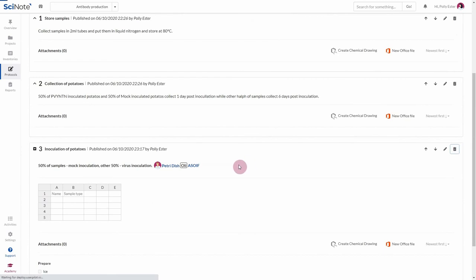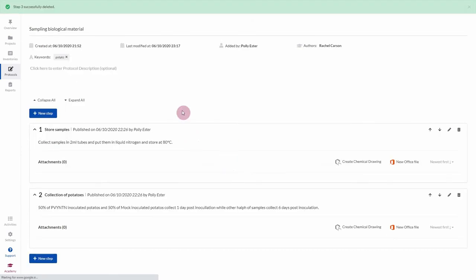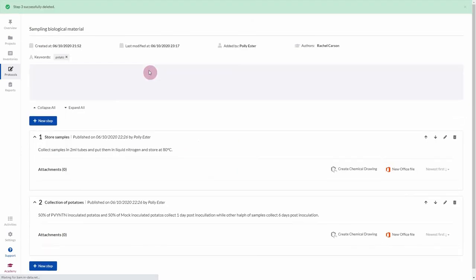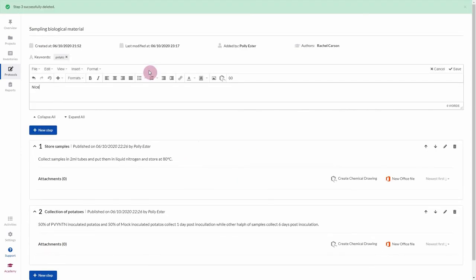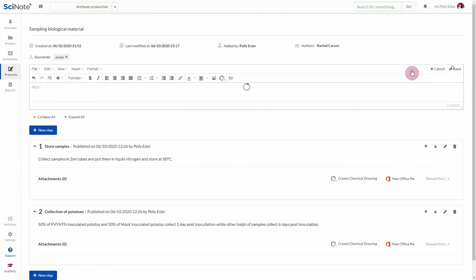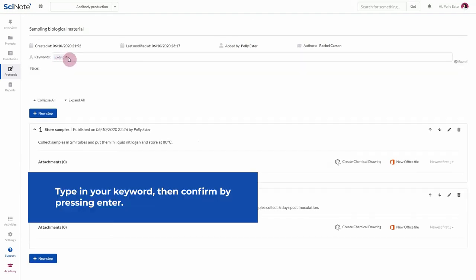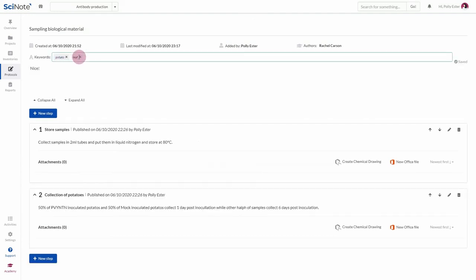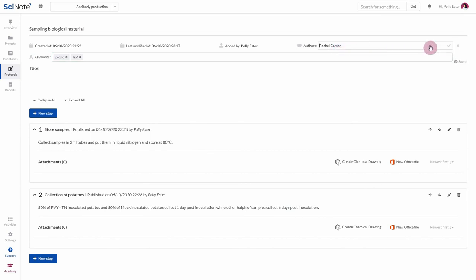If you want, you can add a description to your protocol. If you're creating a protocol template, you can also add keywords to the template. You might be the publisher of the protocol in SciNote, but not its author. If you want, you can specify authors here.